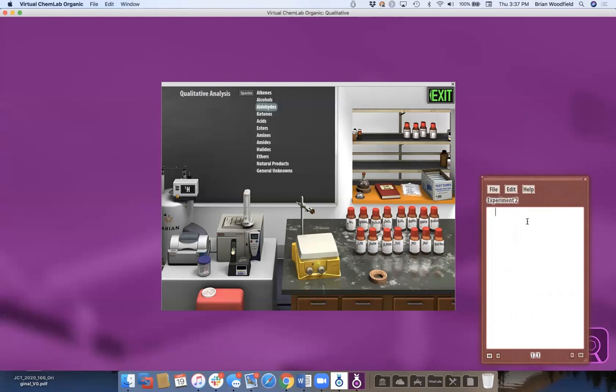And then you can go organize, and then you use these arrows to go between sections. So it's a way for them to record what they're doing and their procedures, and for you to grade them. So it's a great way to have them share their process and their thinking.